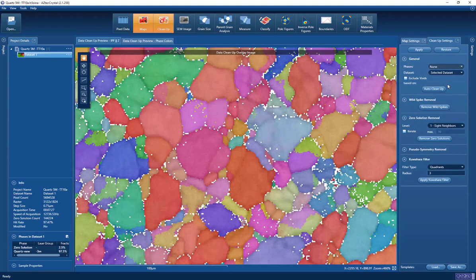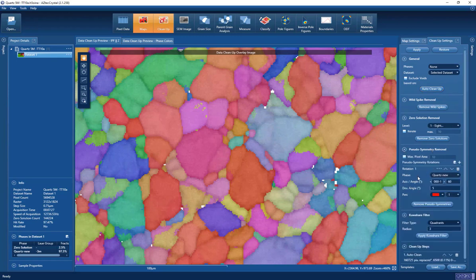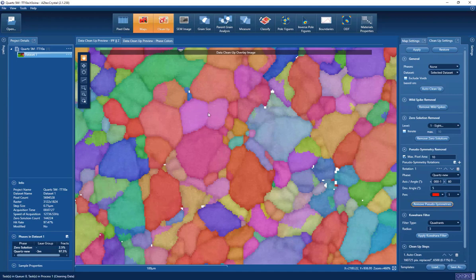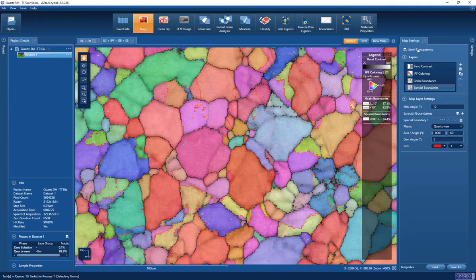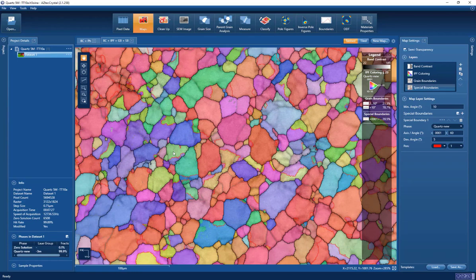When we go to cleanup, we typically run an auto cleanup process that will remove isolated single pixel errors and do relatively low-aggression data dilation to clean up most of the non-indexed points. We can now use a pseudo-symmetry removal tool within our software to rotate those incorrectly indexed orientations. I define the maximum area to rotate — in this case 10 pixels — and after removing them those incorrectly indexed points disappear. When applied to the main data set, the twin boundaries remain intact. So now we have a clean data set at 99.9% indexing.